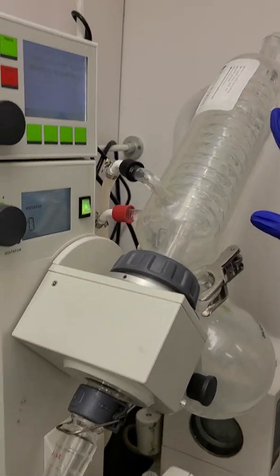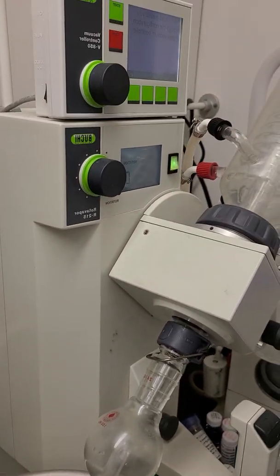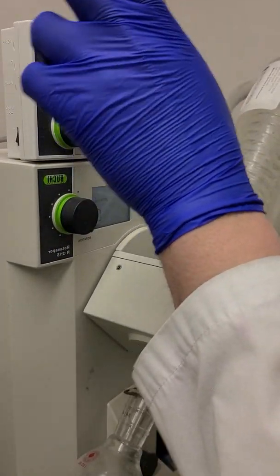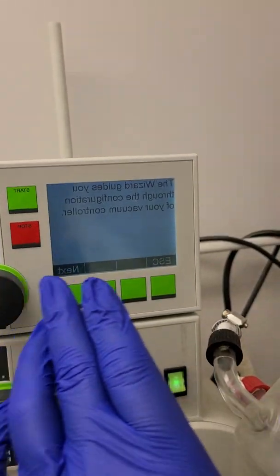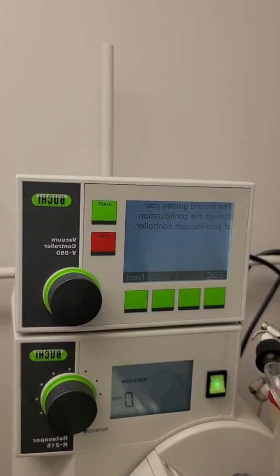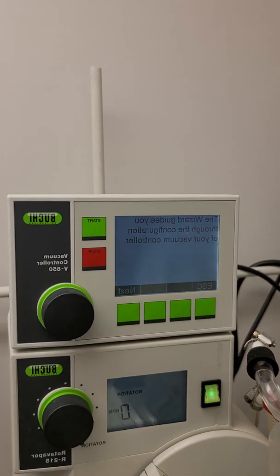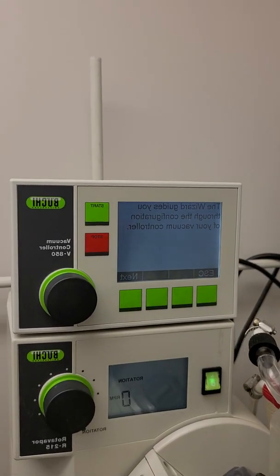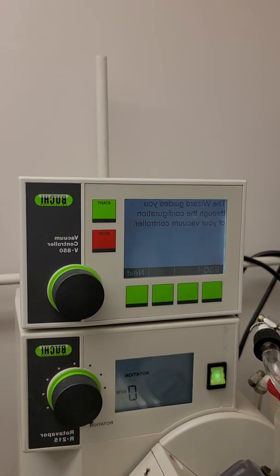Now that the water is running, you can start the roto evaporation. Within here, there are a lot of preset vacuum settings. Depending on the solvents that you want to evaporate, you want different vacuum pressures and bath temperatures. So, for your specific experiment, you need to look up in the literature what the vapor pressure is and at what vacuum pressure and temperature you're going to be able to evaporate your solvent.